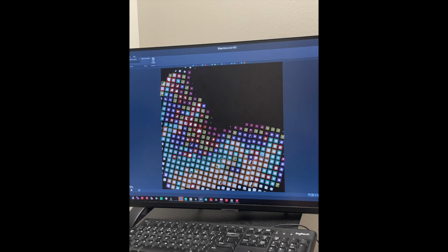What you can see in this image is this dark spot, this black spot, where you know that the grid is over there somewhere. But there's a layer of ice that's too thick over this region so that electrons can't cleanly get through to the other end. So half of the grid is basically unusable. There's still lots of grid squares that we can use to collect data.